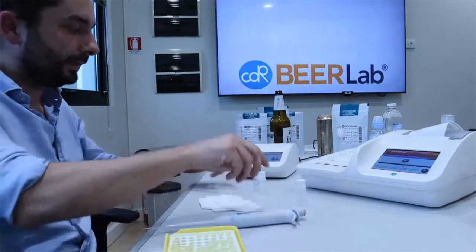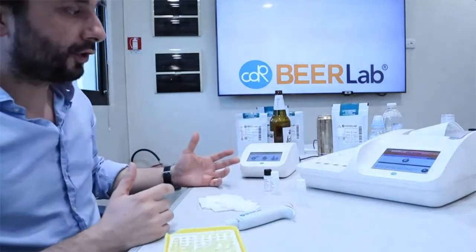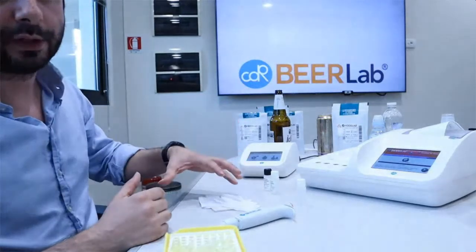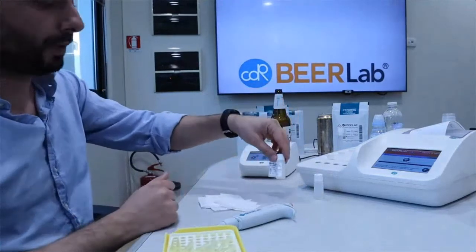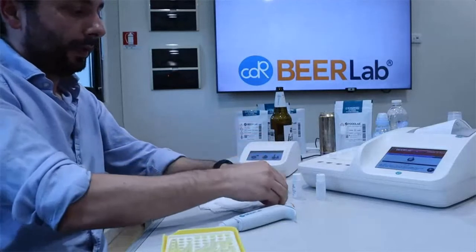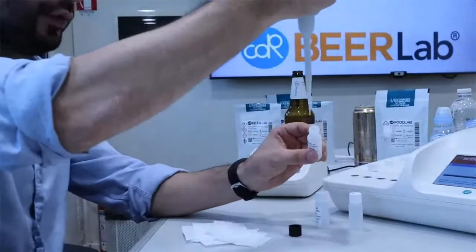Okay, and in the package, as I told you before, we have packages of 10 tests. So inside the package, you find 10 profiled cuvettes, and in this case, 2 bottles of reagents to perform the 10 tests. Okay. So we have 100 microliters of R1A, as it is written on the screen.